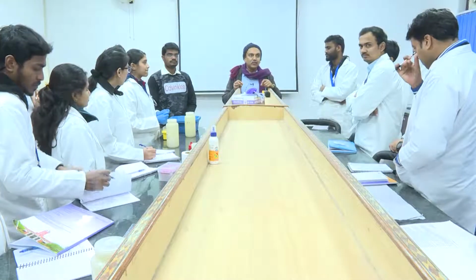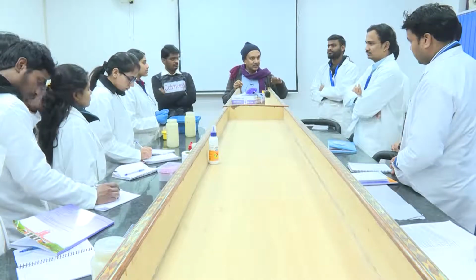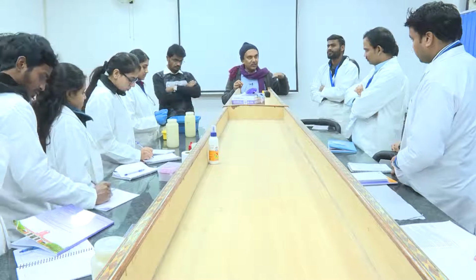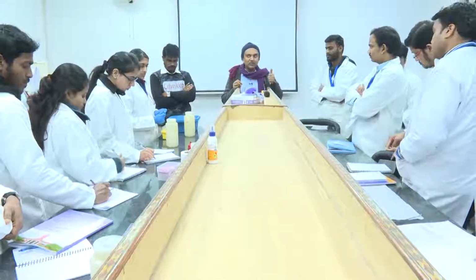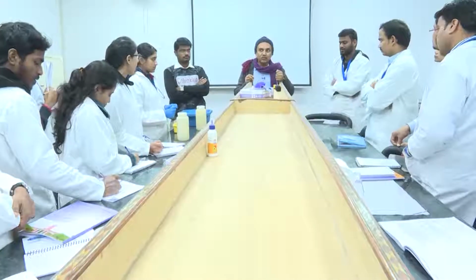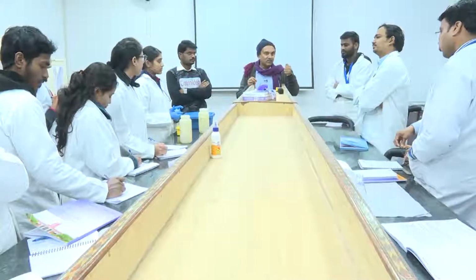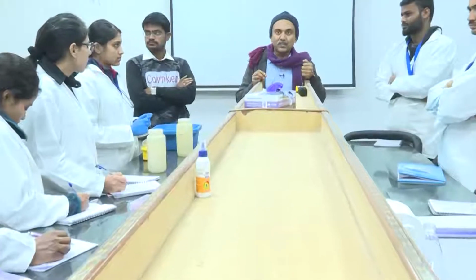And then we also use SYBR Green master mix, again to make sure that our reaction is uniform in all the cases. Most of the mistakes come from pipetting error. If you do not do it properly, all the reagents, dNTPs, enzymes, water, might create problems when it comes to amplification efficiency. Try to minimize the number of times you pipette any of the reagents and prepare the PCR curve.